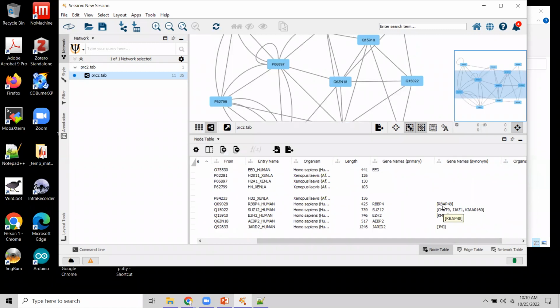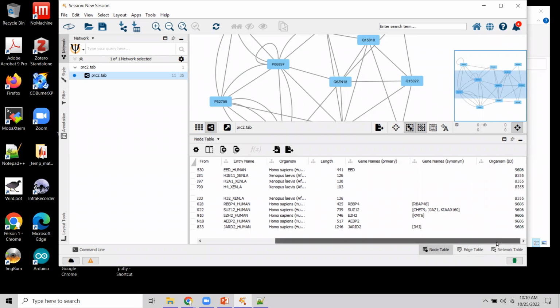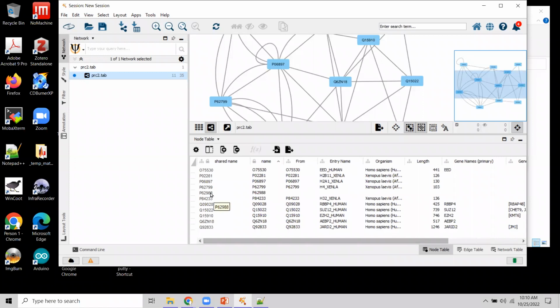So now we do have either nothing or a list of things. Lists are represented by a pair of square brackets with commas separating the values. So some things came in, some things are missing. Let's see what's missing. Why we don't have this thing, I think I know. And I also know about this one, but we'll get to it in a moment.